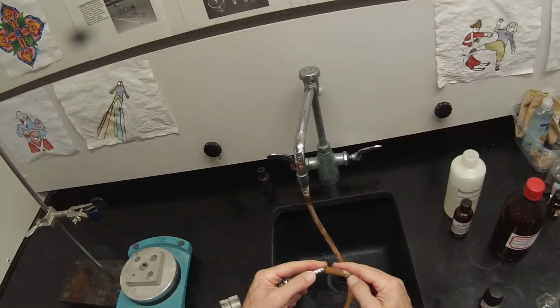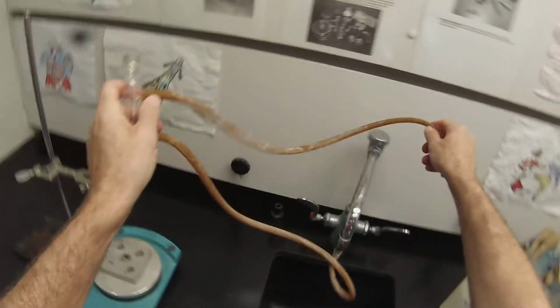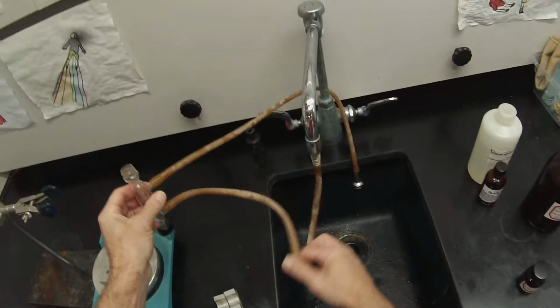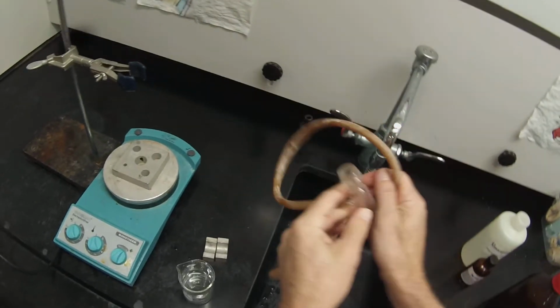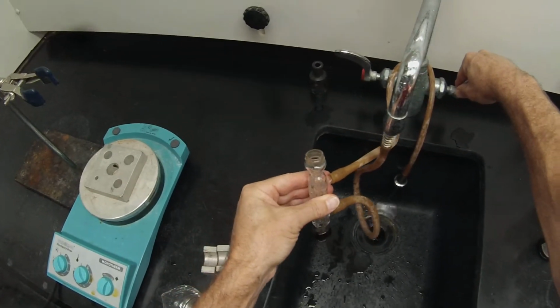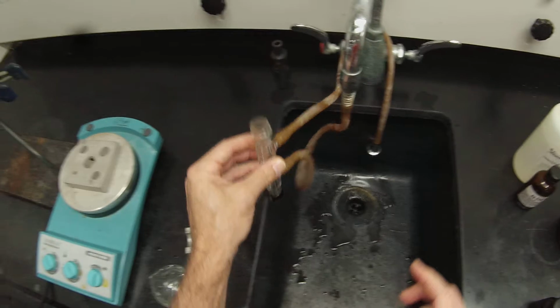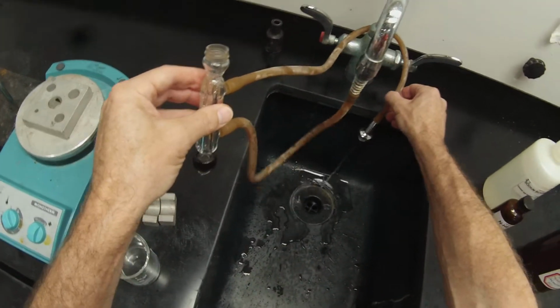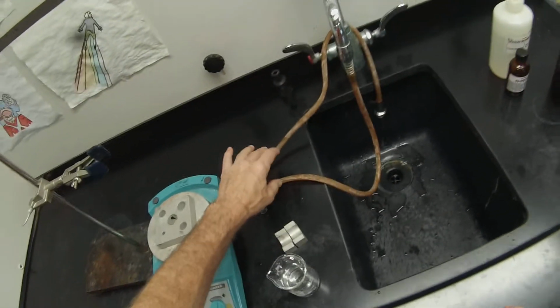And then, as always, I'm going to put a weight on the bottom so that the hose can't come flying out when I don't want it to. And I like to flap that around the back so that I can see the actual flow. Yeah, it's getting a little twisted. Maybe untwist that a little bit. There. So we can start the cooling water. Since the cooling water is only going through the outer jacket, it's perfectly fine to start that. I can tilt it to get rid of the air bubbles. So our condenser is cold, and that's a reasonable flow. Maybe doesn't even need to be quite that strong. So we'll sit that there until we're ready for it.